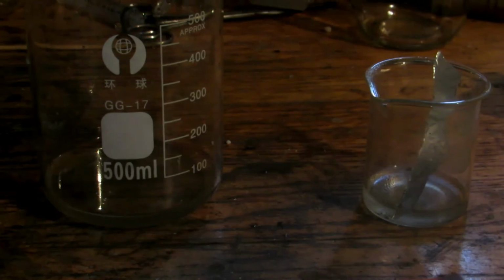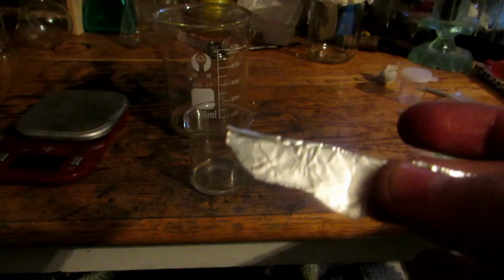Now, of course, this isn't the best indicator, as potassium carbonate is also very basic and will turn litmus paper blue, but our aluminum test should definitely prove whether or not we actually have it. So I'll let this sit for a moment and see if any bubbles occur.